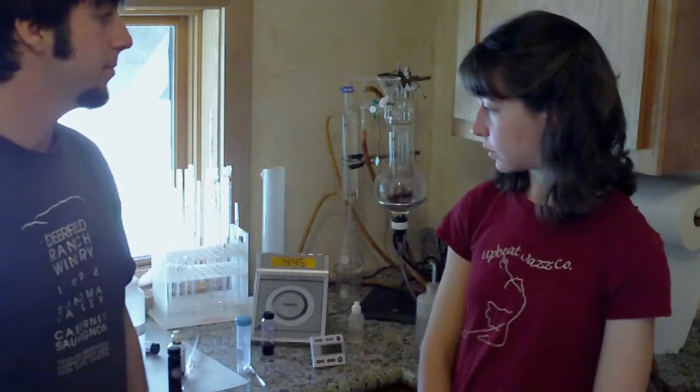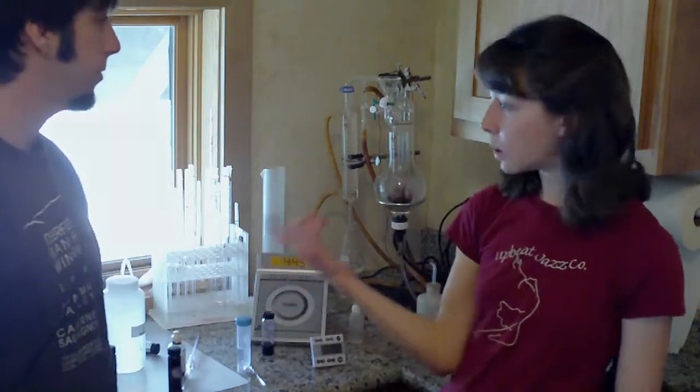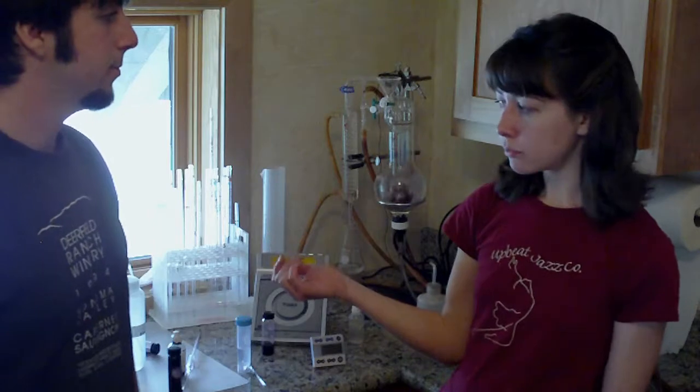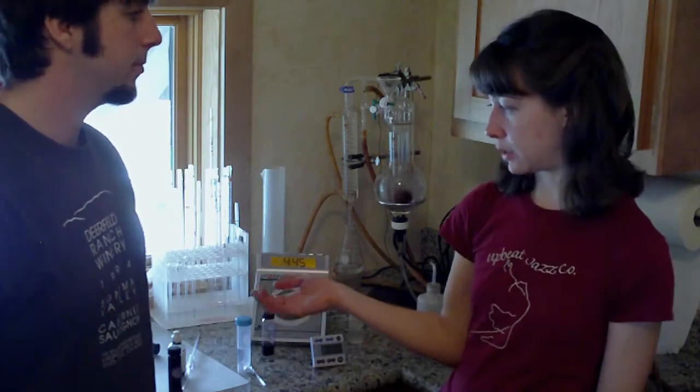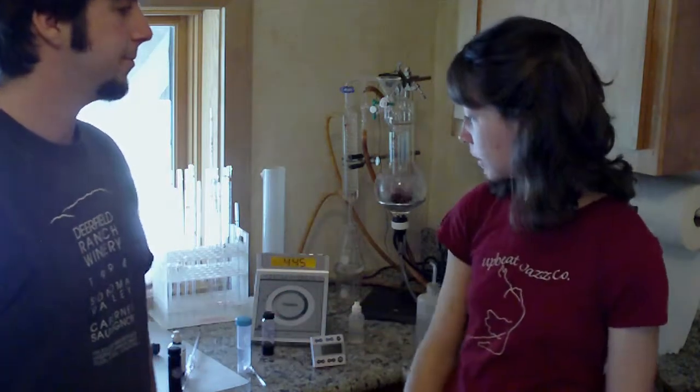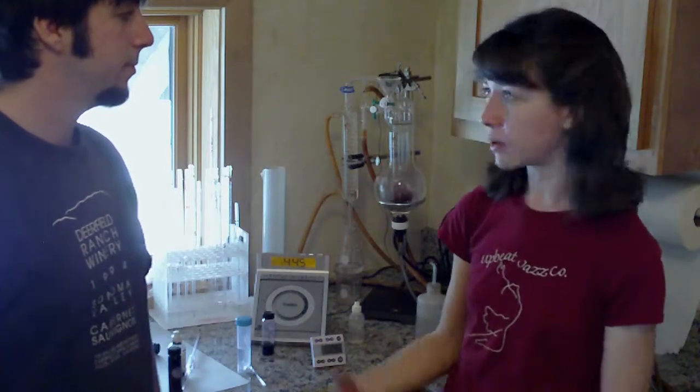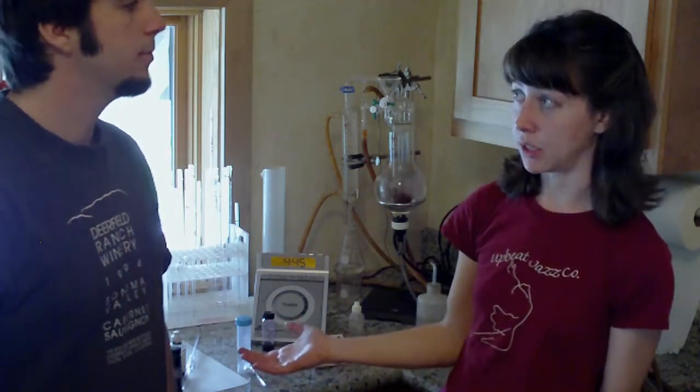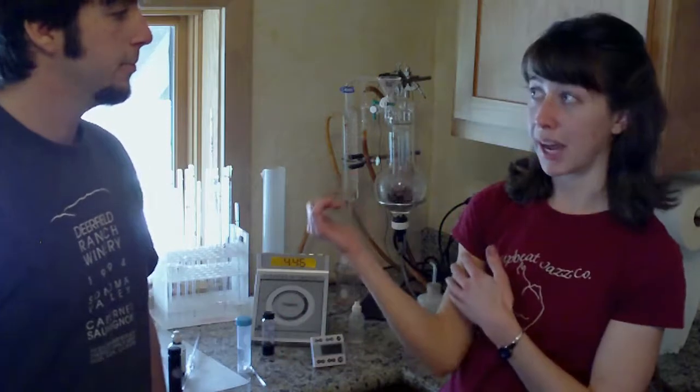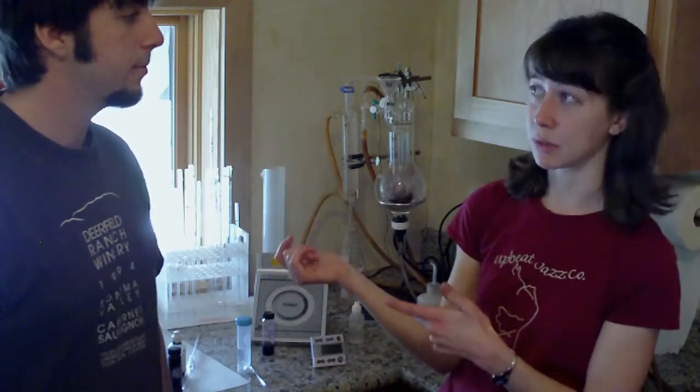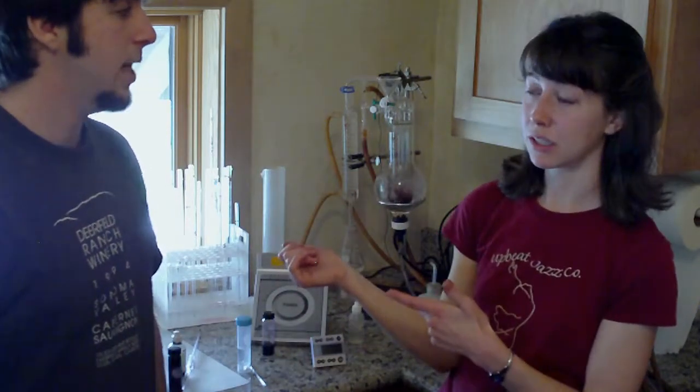I think the best thing that I wanted to say is that we have all this equipment here. It's a small lab, and some of this equipment was pricey, others weren't as much. We got some good deals on it, but we can run all the necessary tests we need without sending our samples out to a lab. And when you're constantly sending out samples to the lab, like, it's really expensive.